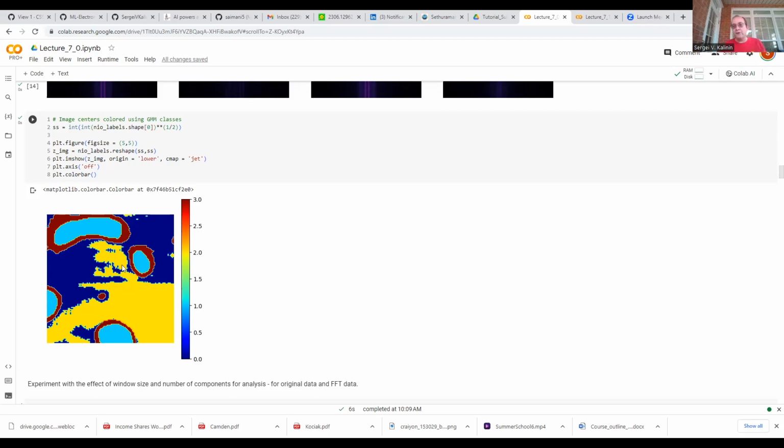So we cannot answer this question. This is the reason why I have shown you the simulated data, because even in the simulated data, when the interface is abrupt, this analysis will always introduce smearing. So if it shows that there is something unusual here, it serves as a signal to pay attention and explore this in more detail. It's not an answer. Notice that this small region over here shows only as phase number 3. So either our window is too large, or this is the same interfacial phase.